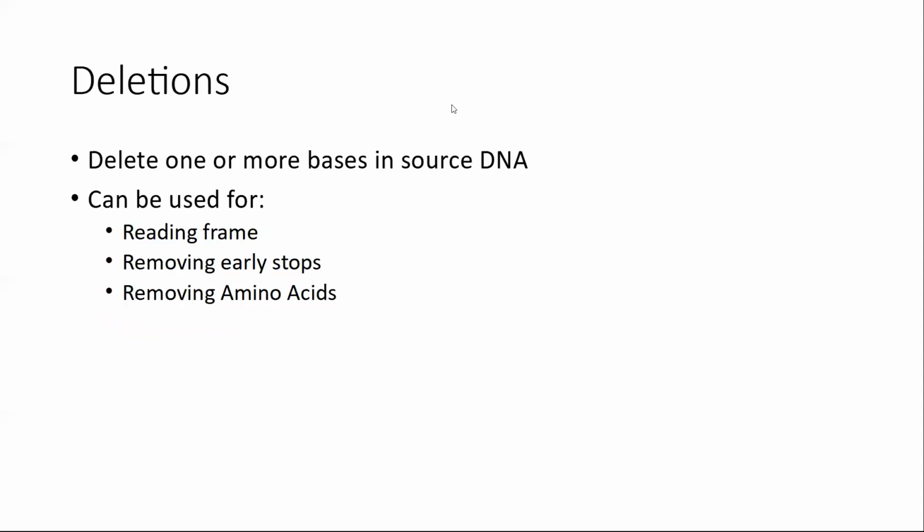So with deletions, you can move the reading frame. So if you ligated your DNA with a blunt ligation and had some erroneous insertions from that, this can be used to fix that. Of course, it's still not 100% efficient or successful, so you still have to do some sequencing, but it can be really beneficial to try this over trying to use a primer over the site and then try to religate it and re-express it.